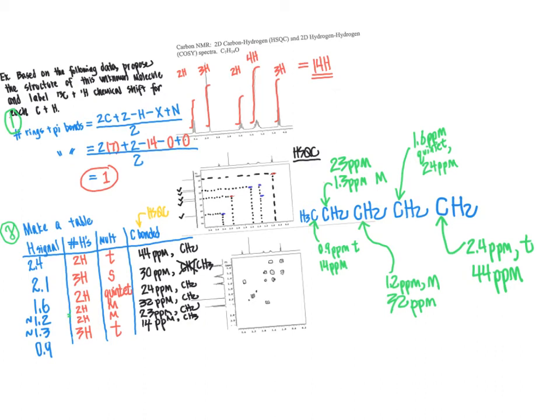So this signal, the fact that it is a triplet here, indicates to us that the only vicinal hydrogens to this carbon have to be the CH2 group, that there can't be any vicinal hydrogens over here. Instead, whatever is bonded over here would have to be a heteroatom or a quaternary carbon, one or the other, because otherwise, if this was a carbon next door that had hydrogens directly bonded, this could not be a triplet. It would have to be some more complex splitting pattern. The triplet indicates that we only have 2 vicinal hydrogens. We've already accounted for those.